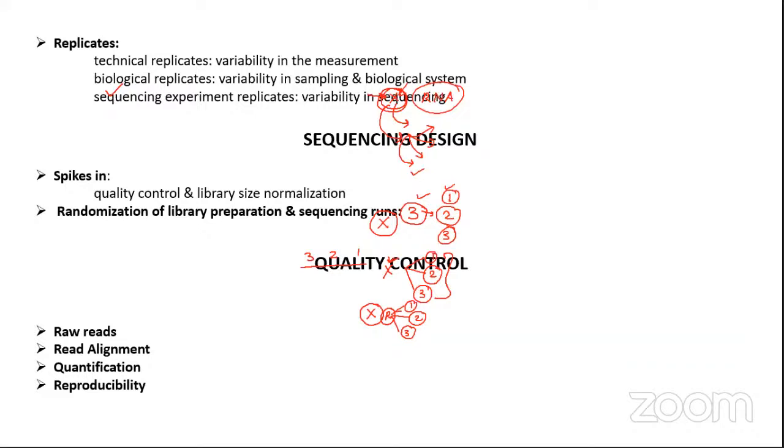And when we have replicates, we have to put them in different lanes of the instrument. So this is our flow cell, to avoid the lane error. One replicate we can sequence here, another here, and we can pool the data and take the mean of it.